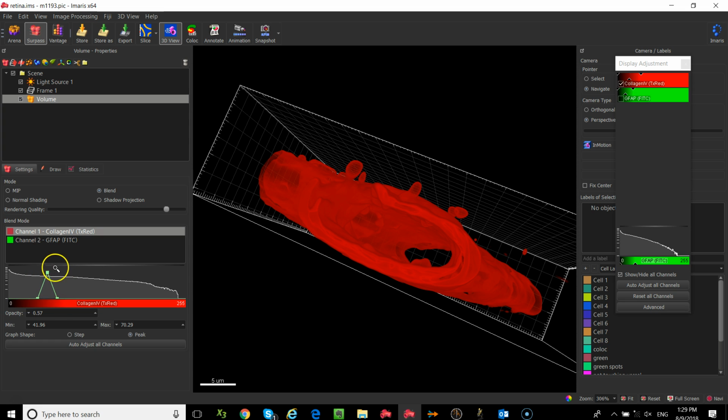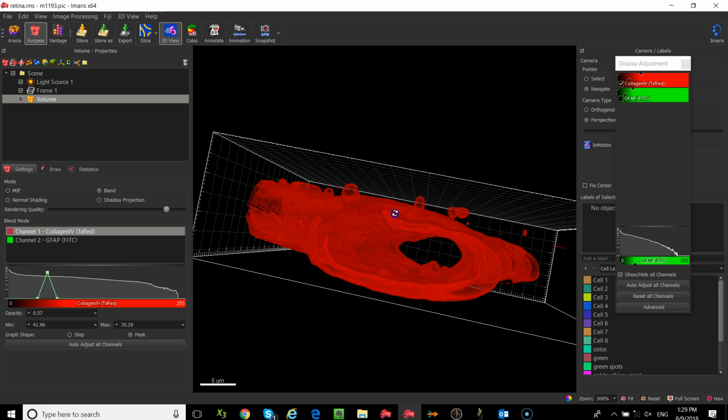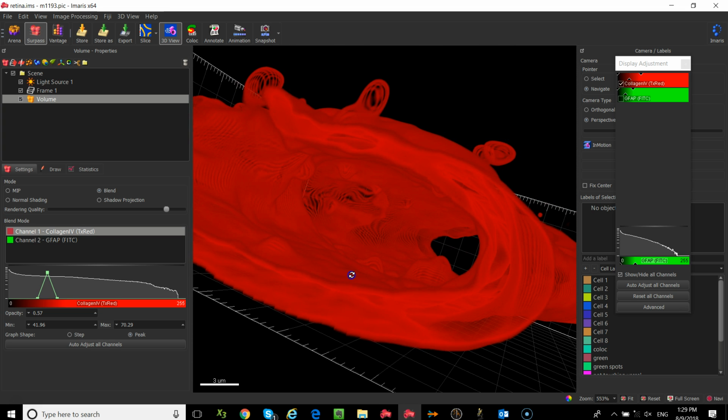And this middle point here is still controlling opacity. Okay? So this is basically isolating the intensity values that are inside this range that you're looking at, that's described here in the min and max dialogues. You can then, and hopefully see something similar to what my image looks like right now, which is basically a vessel that looks like it is hollow.